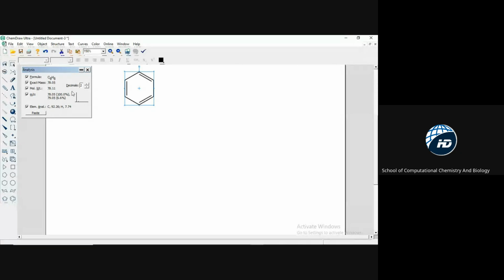You can rely on it because the prediction is not just like you think something and say it, like the way we predict bets. The molar mass is not there among the chemical properties. Okay, I generated the chemical analysis window.